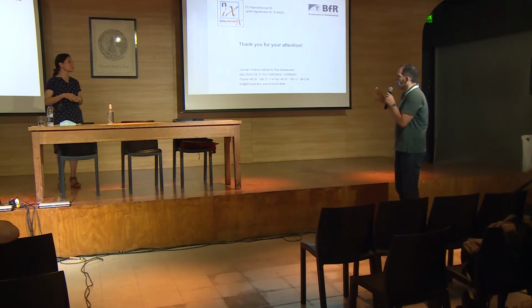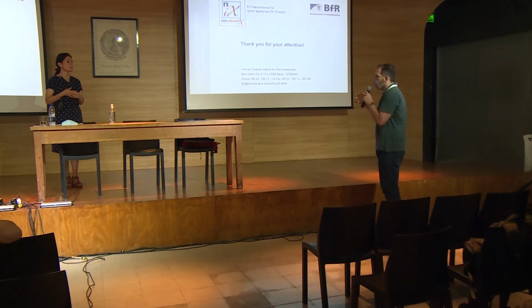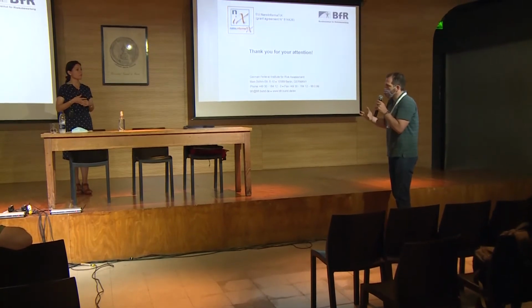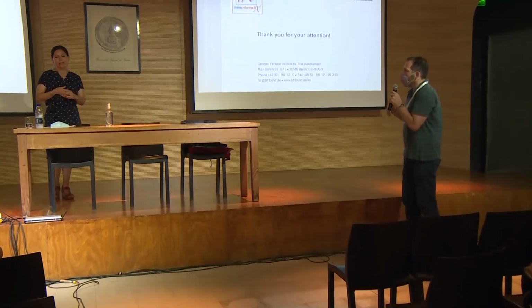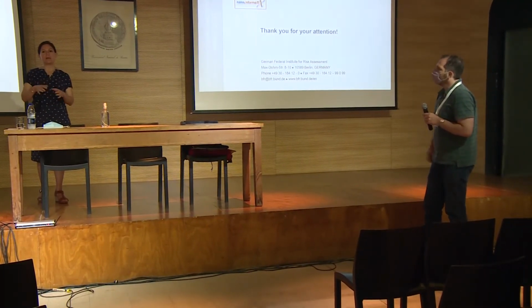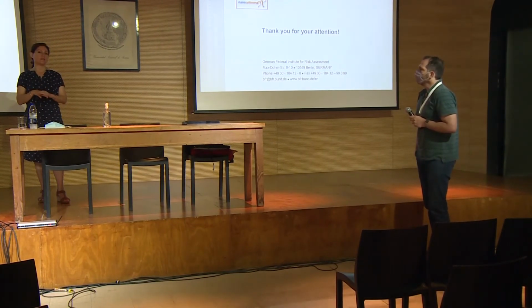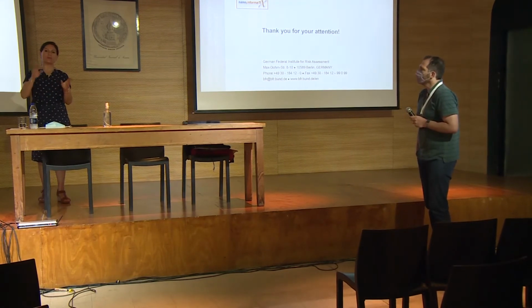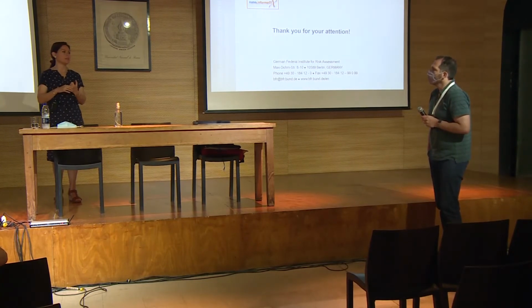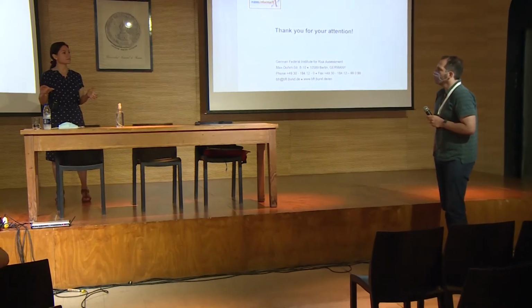Did you train your algorithm, or did you test it in a biased way? Have you tested if your algorithm makes mistakes? We have many data sets that are obviously bad. When you look at them, you see that the quality is really bad. A replicate doesn't correlate, and you see this is a really bad quality project. If you process it with the workflow, you get nothing.